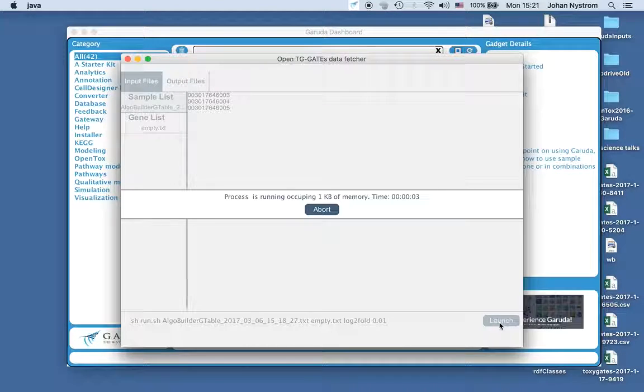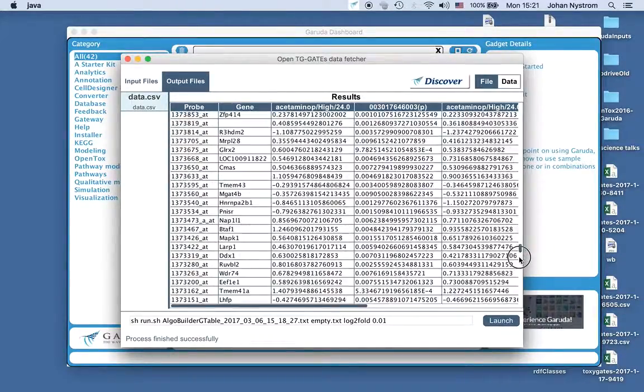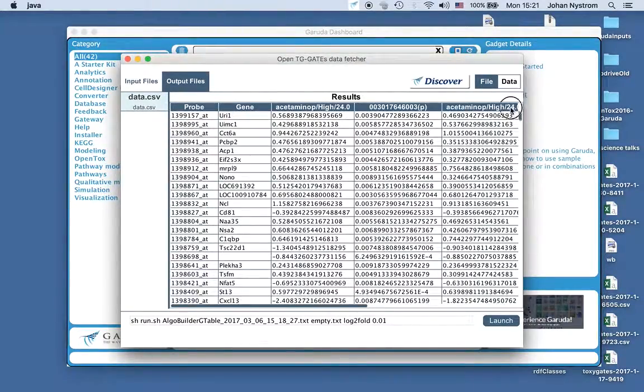and this is going to be quite a bit faster. And now I have only those genes, a few hundred or so, that have this p-value or less. This gives us a rough indication of what are the significant genes for those samples at that time point and dose level.